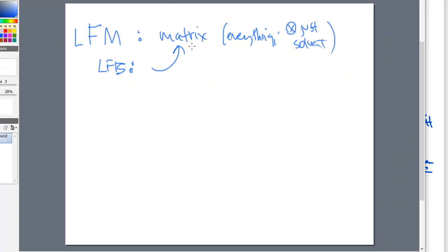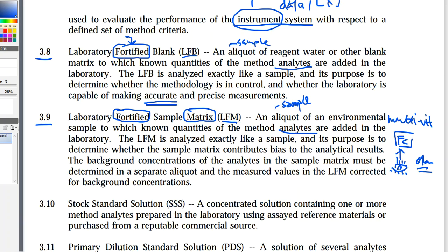All right. So the process is the exact same. What happens here is that we have a known amount of our analyte that we want to look for. In our example that we've been carrying through all of these, it's been a known amount of maybe iron, right? So again, I'm taking the sample, I'm adding a known amount of iron to it, and I know what should be there, and I know what should not interfere, and I know what my report should be like, and hopefully on the back end of this, it actually shows up that way.